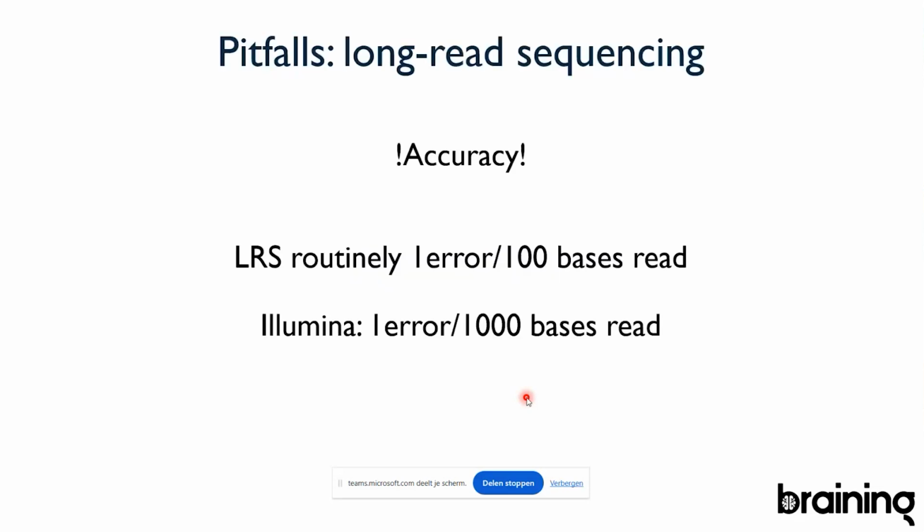So, are there any questions about the long read sequencing and the principles behind it? No. Okay, good. One of the things that I haven't talked about is cost, and that is actually because next generation sequencing and long read sequencing have at this moment a very similar cost. It's not that one is much more expensive or whatever.